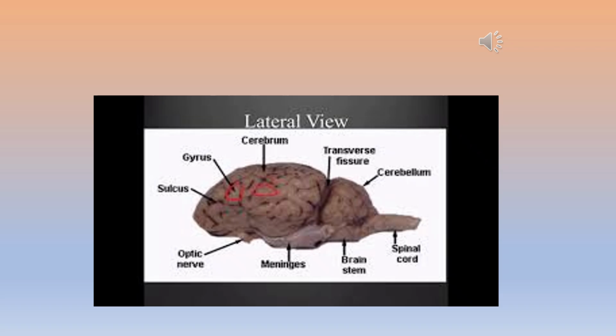That area that is pointed to and referred to simply as brain stem, we will identify more specifically as the medulla oblongata. And then, alas, we have the little spinal cord. So I have two more slides that show the whole sheep brain. Let's have a look at those.